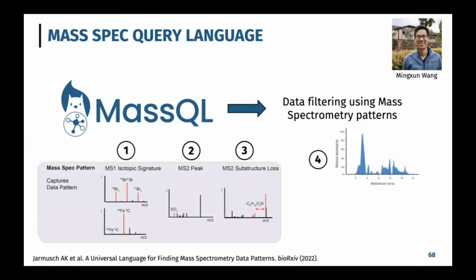If you do chromatography, you have retention time information. If you do ion mobility, you have drift time information. So every mass spectrometry experiment that's done in the world is defined by these 5 characteristics, and how you interpret that information will allow you to uncover new biology.